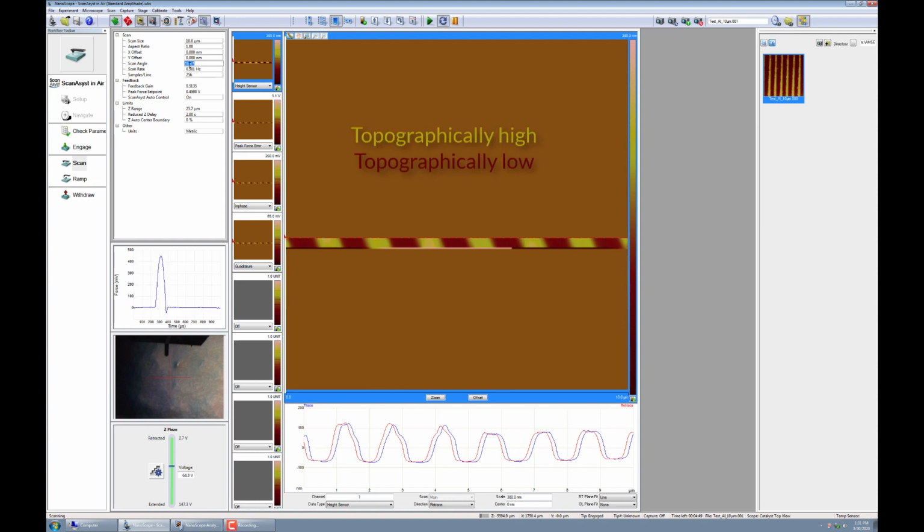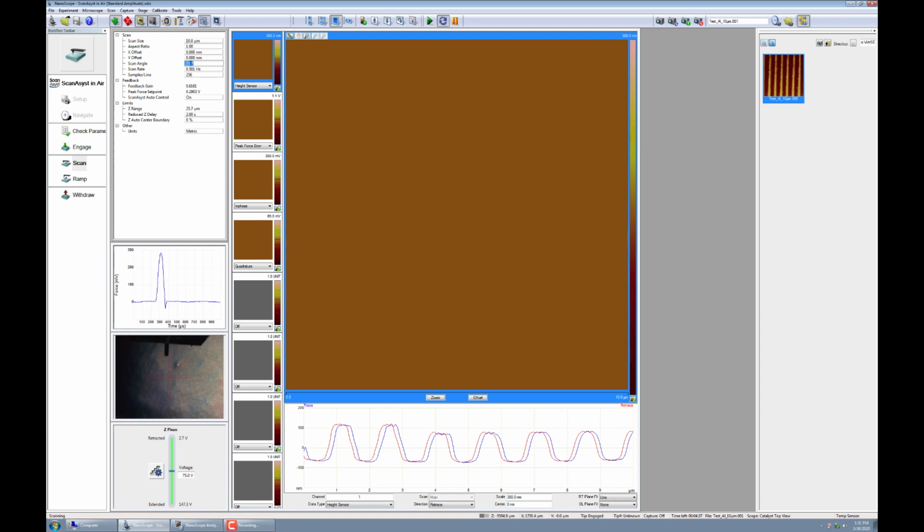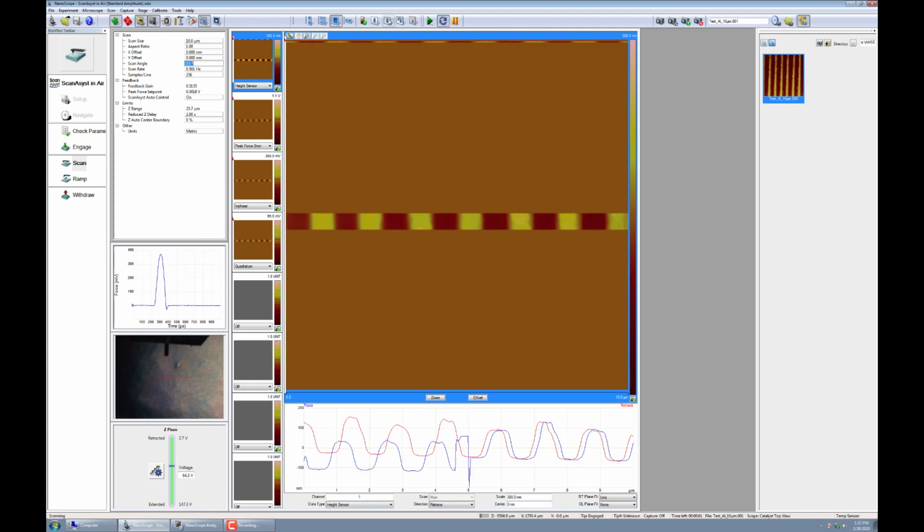On these images, the darker colors are topographically lower and the lighter colors are topographically higher. Okay, so I think that made it worse, so we're going to try -10 instead. Alright, that's looking much better, so I'm going to start it just scanning from the top now, since it's starting in the middle of the image, so we'll start seeing it come in down from the top.